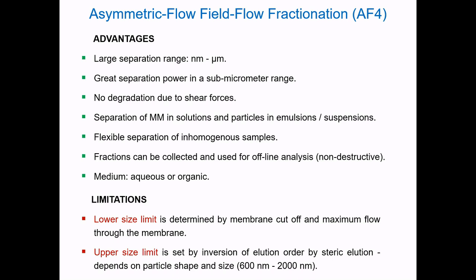The separation can be carried out not only of macromolecules in solution, as is the case in SEC, but also particles in emulsions and suspensions. AF4 is flexible also for separation of inhomogeneous samples, and moreover, fractions can be collected at the channel outlet and further offline characterized, since AF4 is a non-destructive technique.